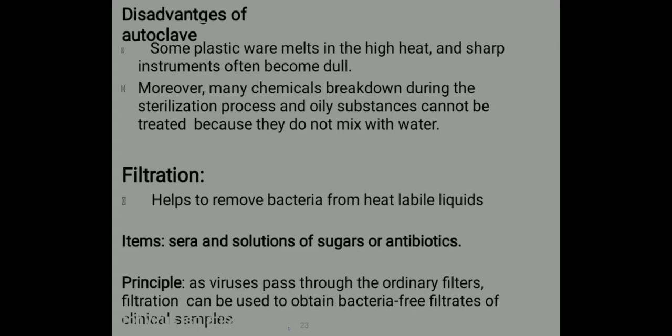Disadvantages of autoclave. Some plastic ware melts in the high heat and sharp instruments often become dull. Moreover, many chemicals break down during the sterilization process and oily substances can't be treated because they do not mix with water.